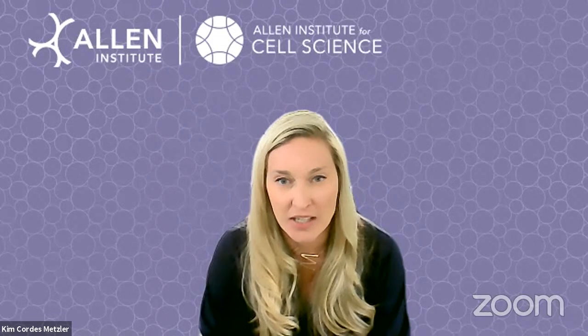So Kim, we've got a number of good questions coming in. I'm going to start with one from the chat box. What type of laser microscope is used in imaging our lines? Yeah, so we use spinning disc confocal microscopes in imaging our lines. In particular, we've used Zeiss and a 3i imaging system.